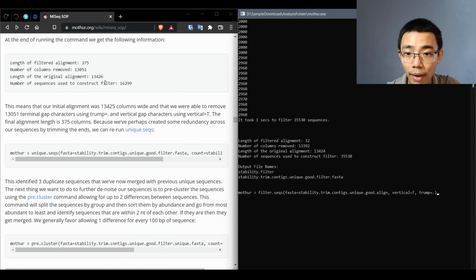Okay, so once we've done that, we can actually look at how many sequences we have. I have a lot more sequences than the original and a lot fewer unique sequences than the original, and my start and end are completely wrong. So something is completely wrong in my sequence analysis. Let's go back and try to estimate where I went wrong. I might have double-run some of the things. So let's go to the beginning, at screen sequences right here.